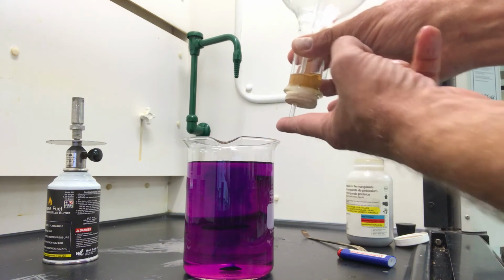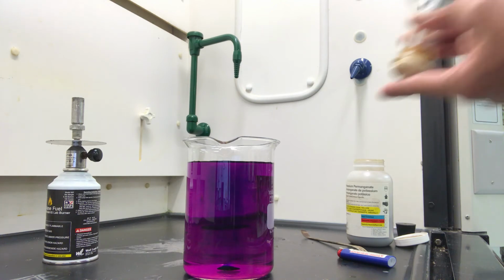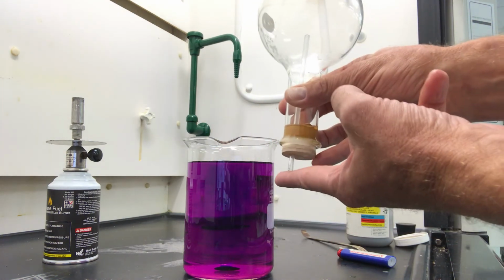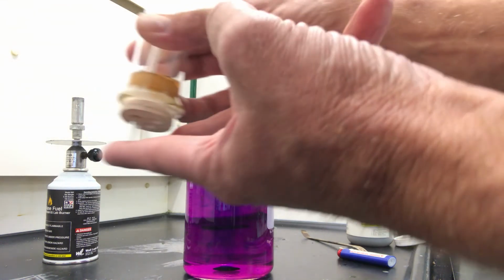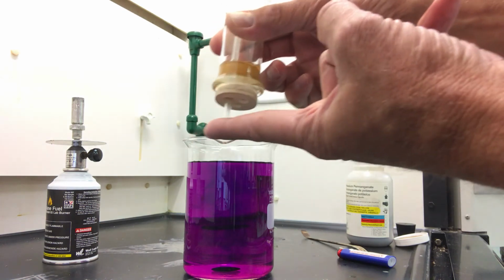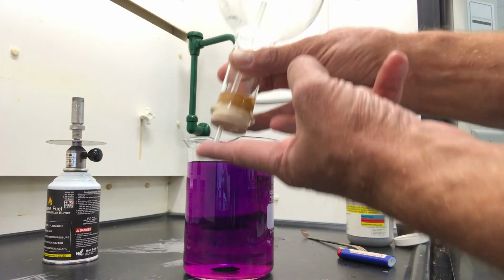Ammonia is very soluble in water. What do you think I mean by soluble? When we say it's very soluble, what does it want to do in water? Dissolve. Okay. So the ammonia gas inside here dissolves very easily in water. And it's going to be in contact with water because this tube is going to allow the ammonia gas to touch the water. So ammonia is very soluble in water. That's a key for this experiment.